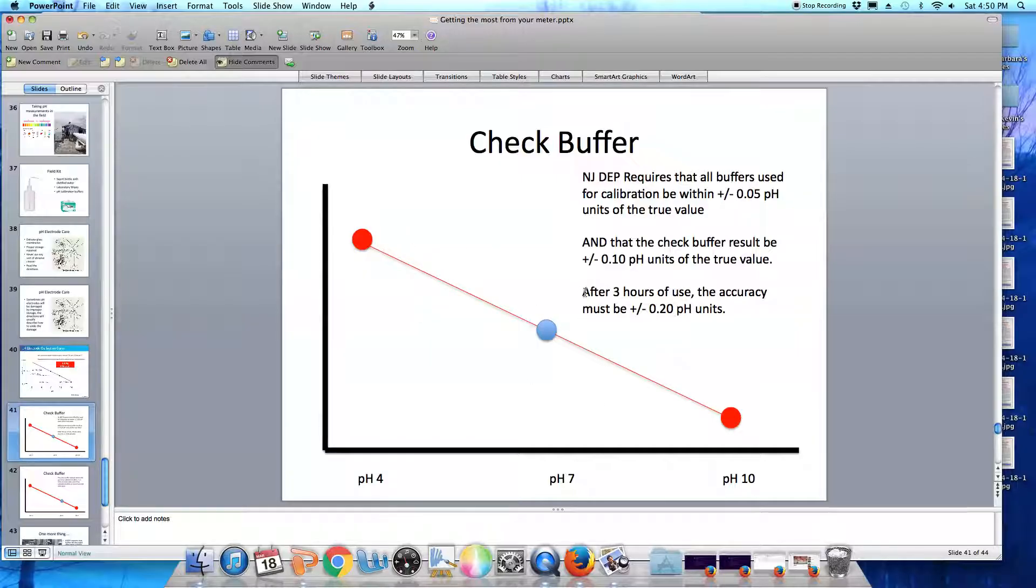All pH meters can drift, so after three hours of use, you should double check your meter with your check buffer. Re-read that pH 7 buffer as if it were a sample, and it must be within plus or minus 0.2 pH units of pH 7. So in this example, after three hours, any value between pH 6.8 and pH 7.2 means that your meter is still in calibration and you can continue to make measurements. If it doesn't meet this criteria, you must re-calibrate your meter before you make any additional measurements.